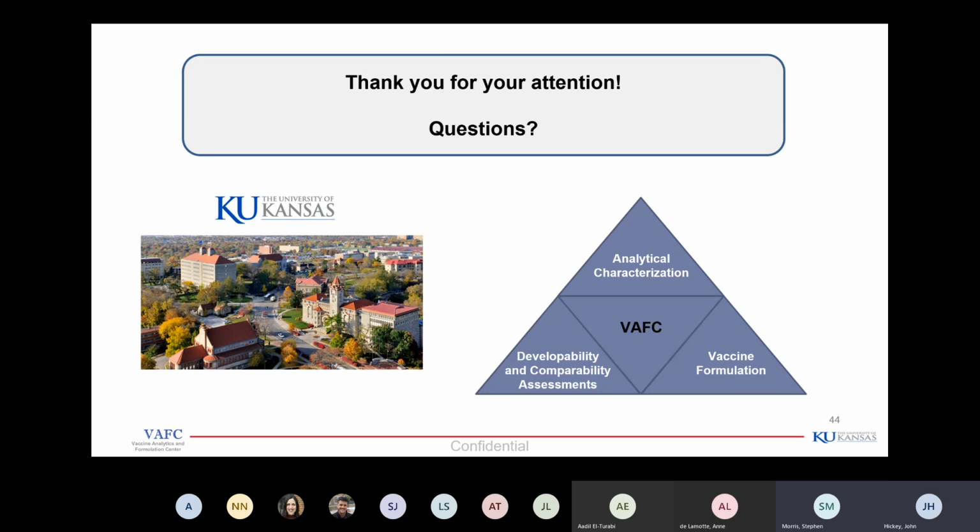Yeah, we actually typically run into that, especially with our collaborators who are working with early material where they think they have a highly pure, homogeneous mixture, but when we perform our MS-based techniques, we have to let them know that you have this post-translational modification or this truncation, and all these quality issues you need to deal with. Yeah, and because we were feeding that into the early stages of our project, we were able to deal with that. So I think the sooner your assays feed in, the better. Anyway, Adel's waving.